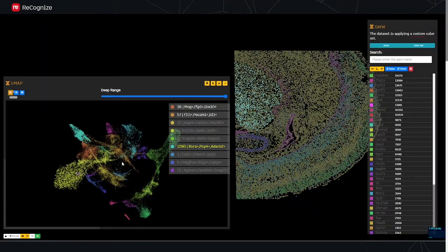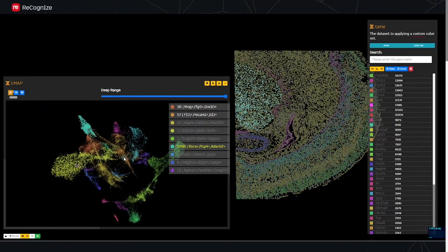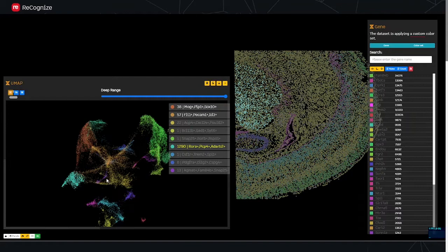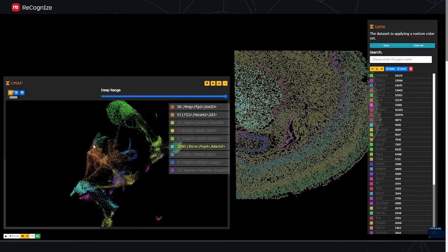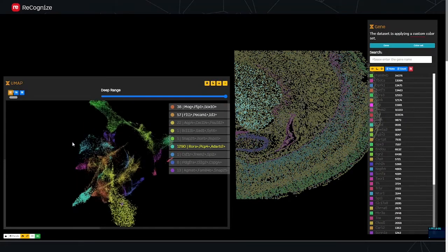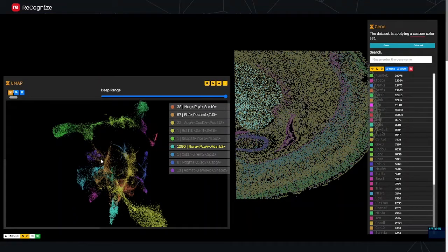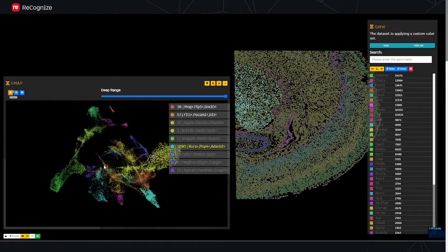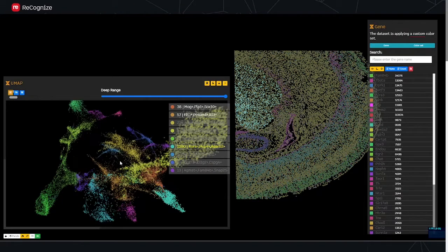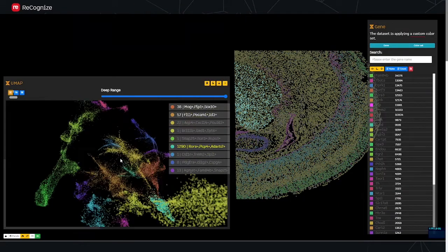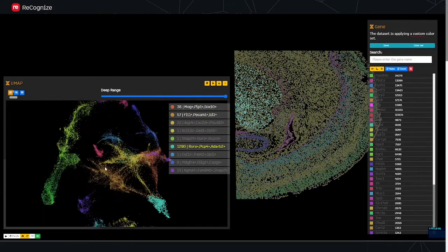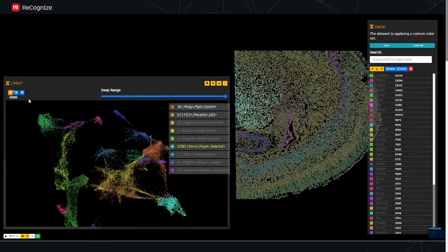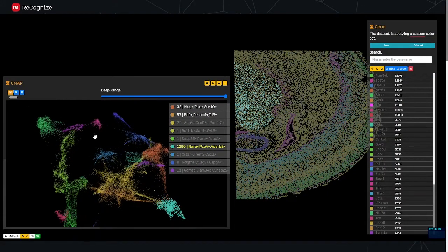And the corresponding cells that are found in this region will then be highlighted in the tissue display. So you can explore the dimensional space, see what cell types are similar or very distinct. Then you can mark these cells in the UMAP plot and see where in the image these cells are located.